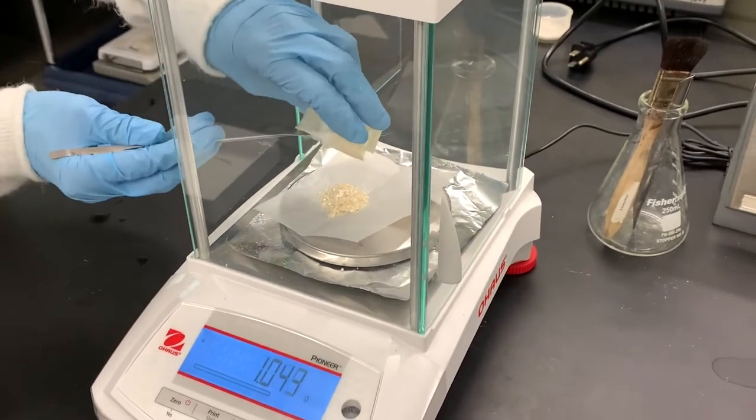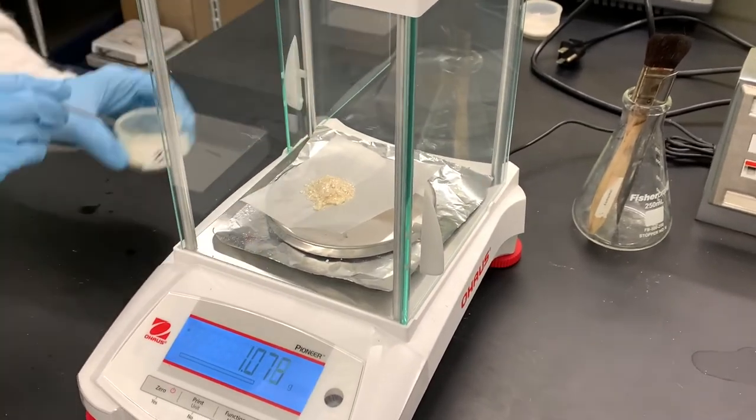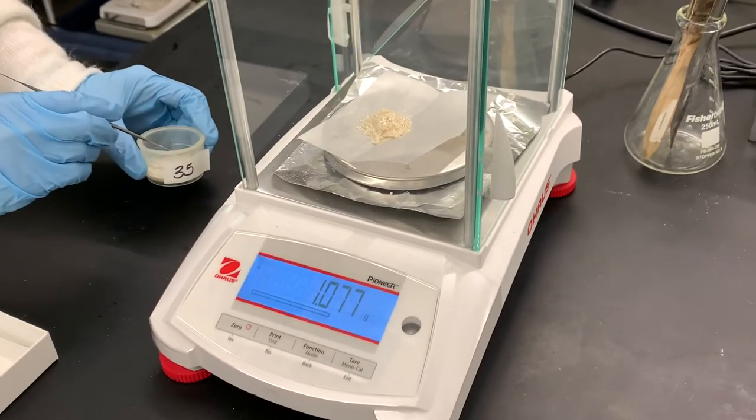Our mass here is 1.077 grams. Now we're gonna check the melting point of our bromo vanillin product. We're gonna be using the melting point to help us identify the actual product of the reaction. There are three different possible products depending on the relative location of the aldehyde group and the bromine that we put on the ring. The first possible product has a melting point of 155.